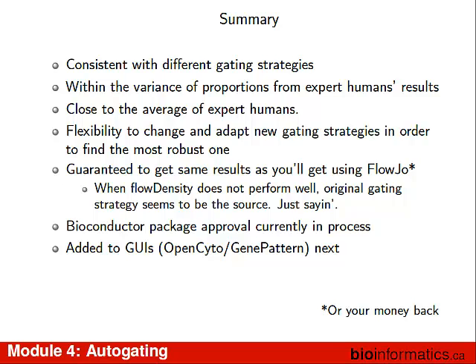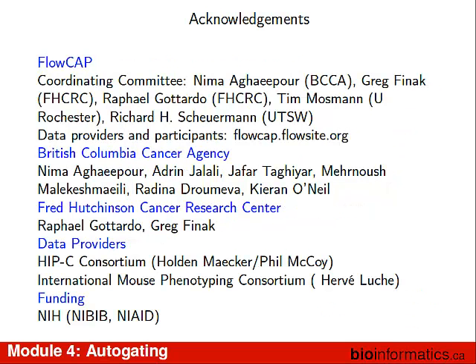It's all in, except it's not in Bioconductor today, but it's in your virtual machines. It'll be in there soon. What we're going to do next is get stuff into OpenCyto and GenePattern, and I think I'm talking about that in Module 6. So again, this is just a large collaborative effort.